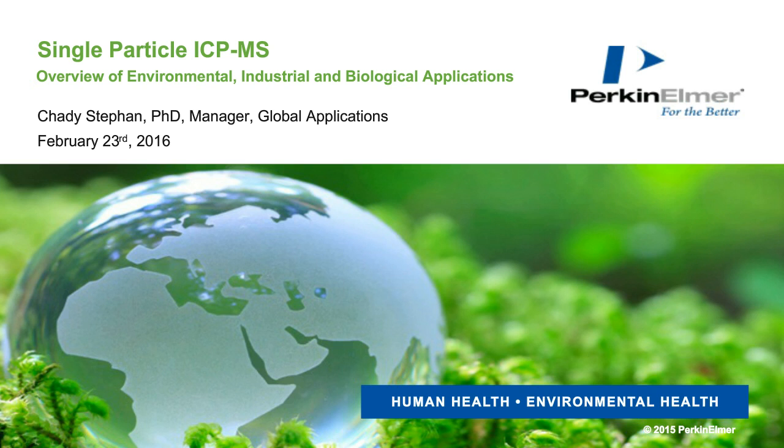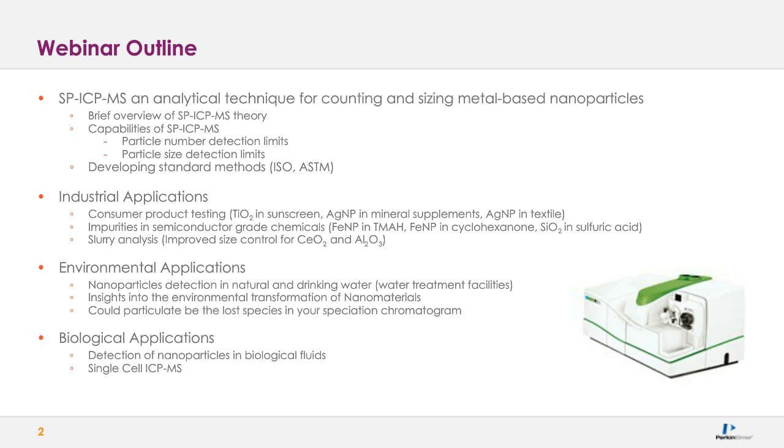We have a heavy agenda for the webinar. I will be briefly going over the theory of single particle ICP-MS for those who are new to this technology. I'm not going to be spending a lot of time on it. There's lots of publications available for review to know more about the theory of this new emerging analytical technique. I'll be mainly focusing on the applications. I'm going to be looking at the three main application markets.